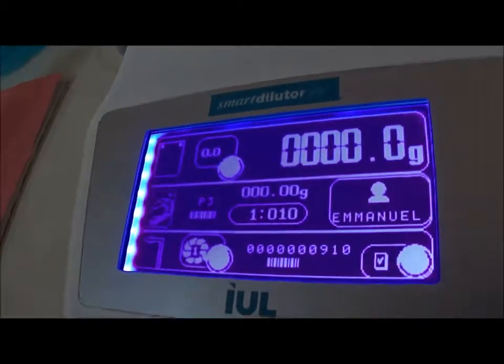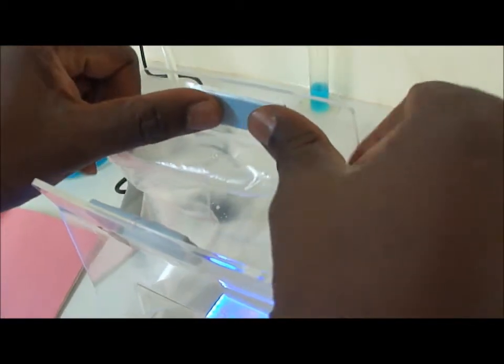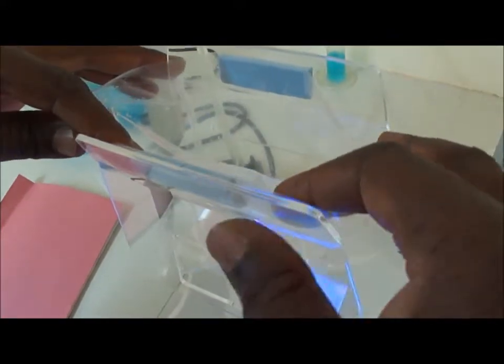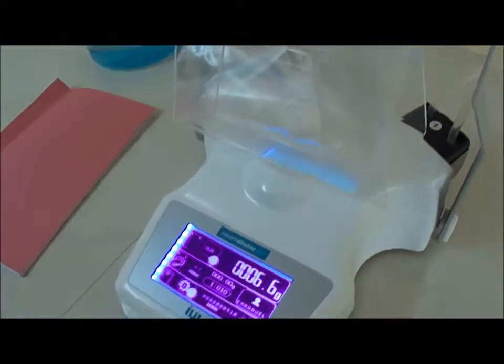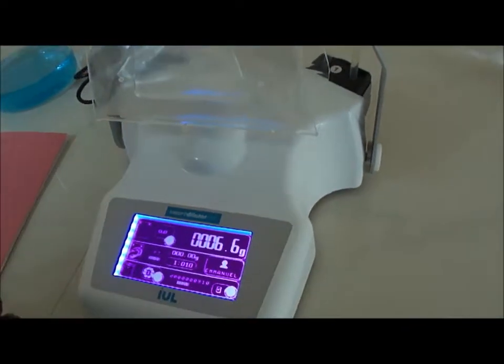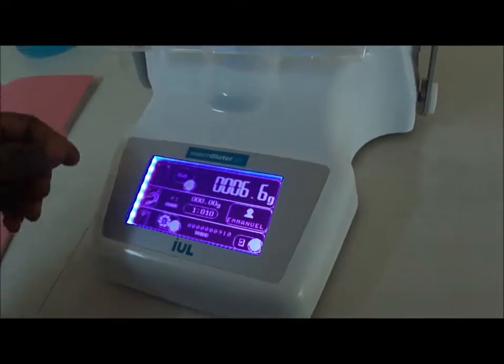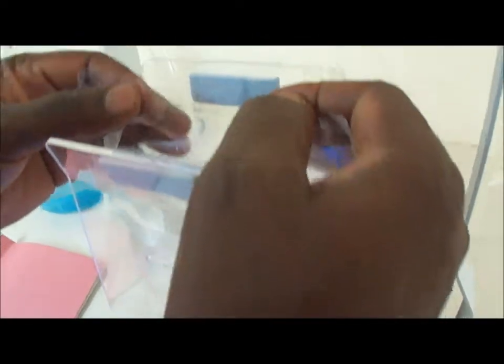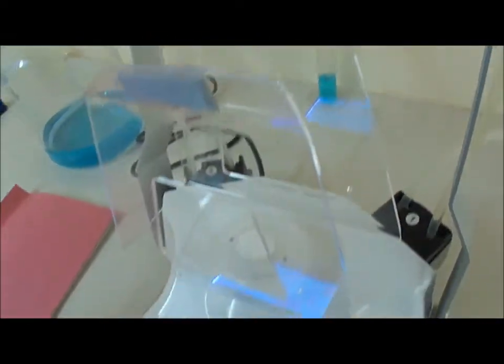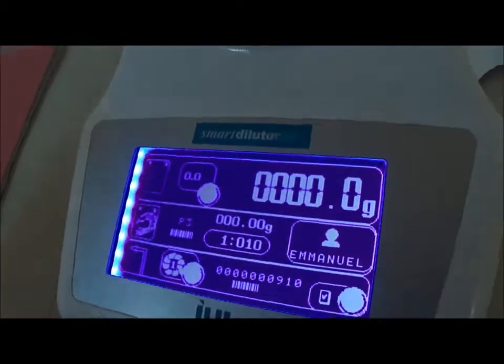First I will put zero, and then I will put inside the bag that will receive my sample by fixing on the top using these tapes, and keep the bag open at the top, while the bottom is supported by the bottom of the plastic support. This is open like that, then I will put in a few minutes my sample. But I have to make the tare first. The tare is done when you have told the machine that is empty. Let's start again. This is zero, so there is nothing on it.